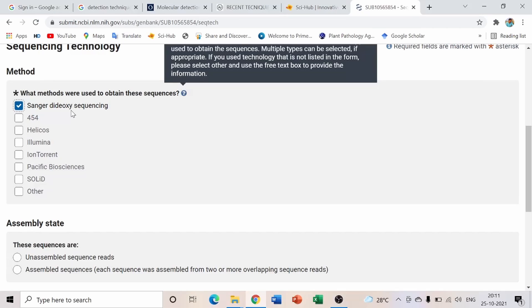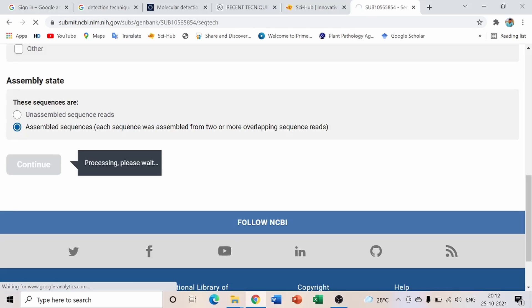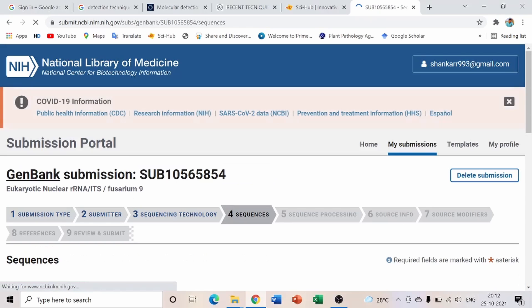Sanger sequencing, also known as dideoxy sequencing or chain termination method, was developed by Sanger in 1977. After selecting Sanger dideoxy sequencing, scroll down to Assembly State. Since our data is already sequenced, select 'Assembled Sequences' and click Continue.